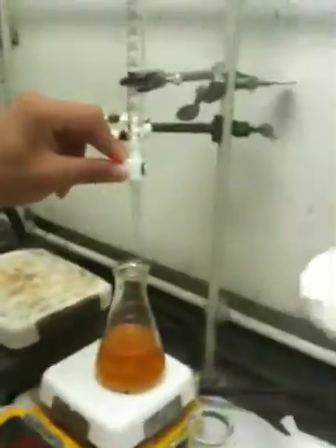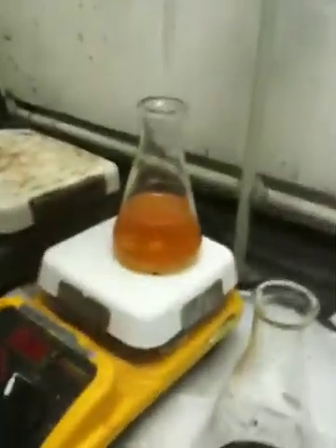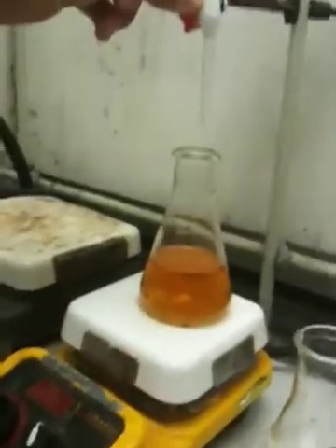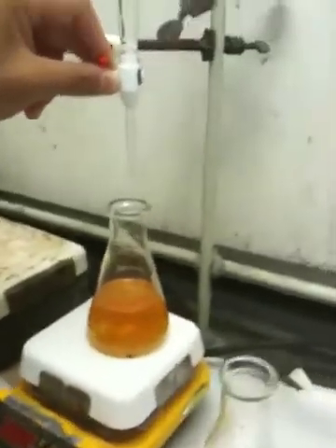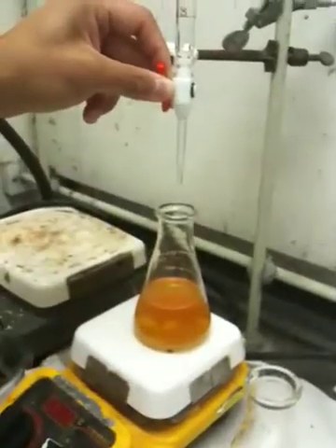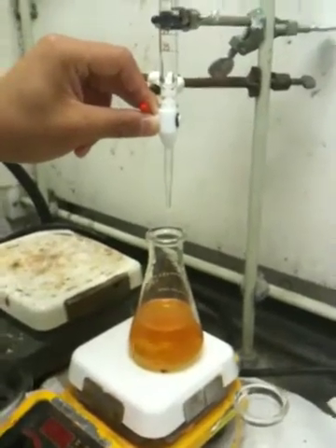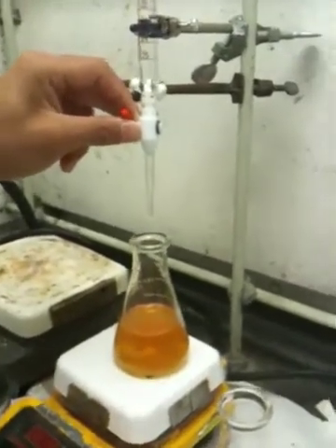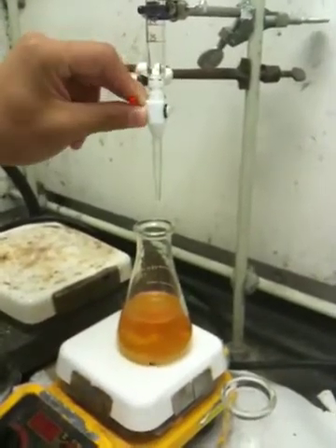And you can see as he's titrating, the reddish brownish color that it originally was is changing gradually to a nice urine-looking color. Eventually Dice K is going to need to get it down to a nice pale yellow. The problem is, if you add too much, that pale yellow quickly becomes clear, and then you're pretty much screwed.